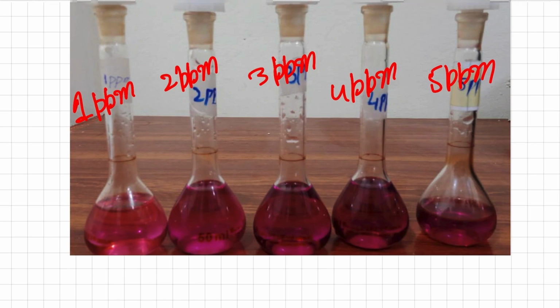So by tuning our sample, we can use the visible spectrophotometer even for colorless solutions. So this was all about today's lecture.